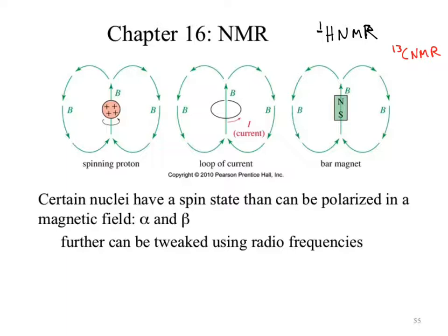The larger issue then comes into the amount. Hydrogen NMR, you can run a good one in about 5 minutes. Carbon, you need an hour, 2 hours. Why? There's fewer atoms that are magnetic, which means I have to run the sample for longer.